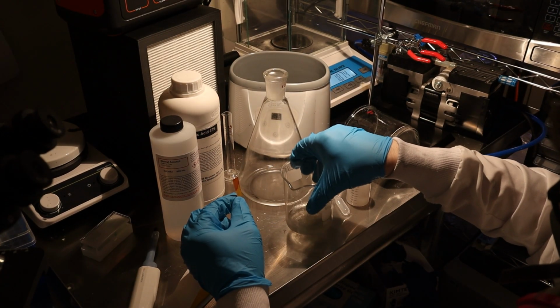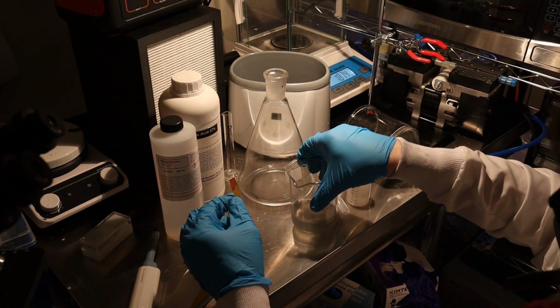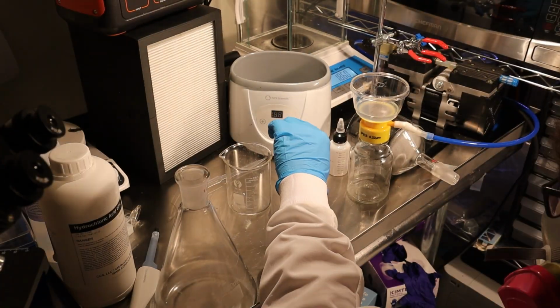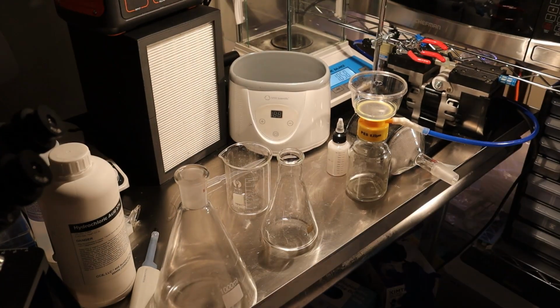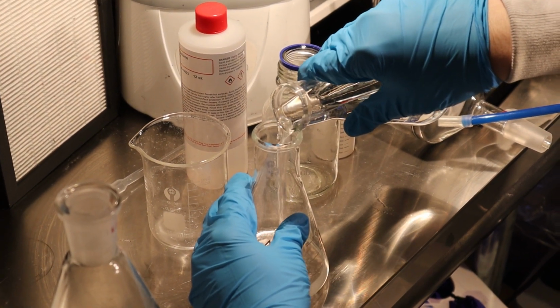It's so cool how it's changing color. Interestingly, the nasty green liquid turned clear when we did this, and some nasty stuff precipitated out when it turned clear, which we then filtered off. It was now time for the cool part. We prepared 5 parts acetone in a flask and poured 250 mils of it into 50 mils of the filtrate.